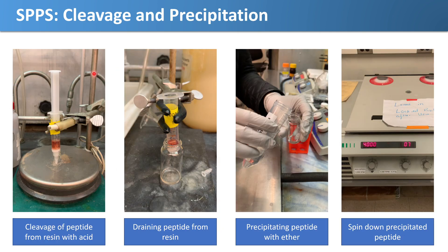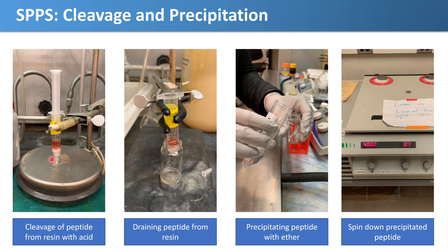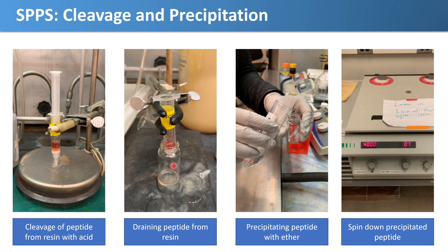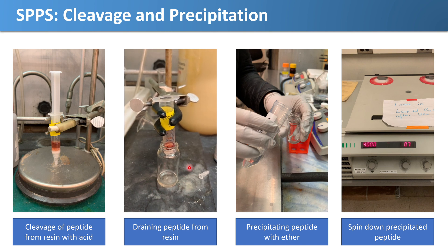At this point, we are ready to remove our peptide from the solid support. We do this by suspending it in acid, and here you actually see it turns this pretty red color in this case with this type of resin. After which, our peptide should be in solution, and by draining the solution from the solid support, we're able to isolate our peptide.